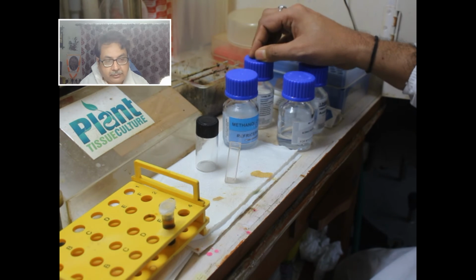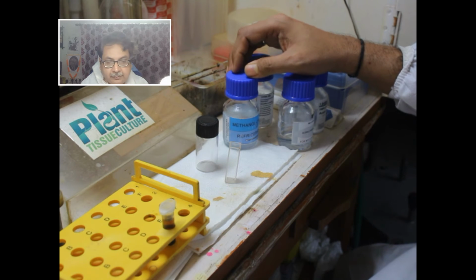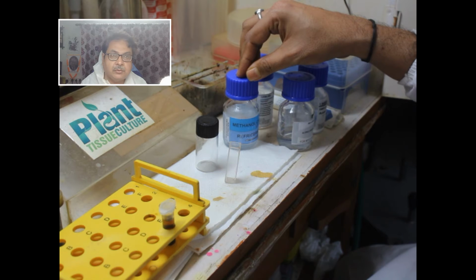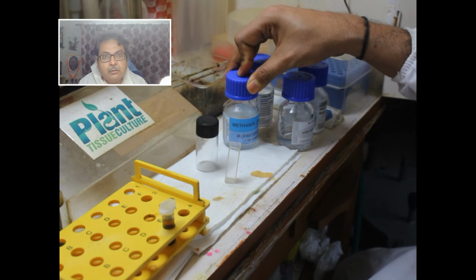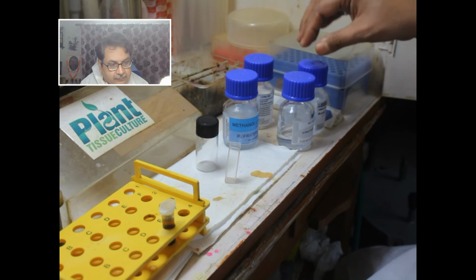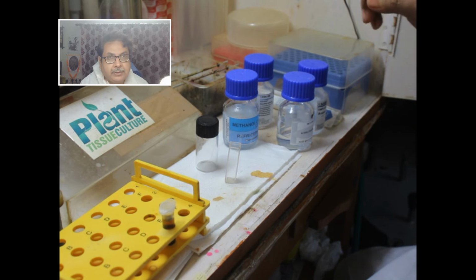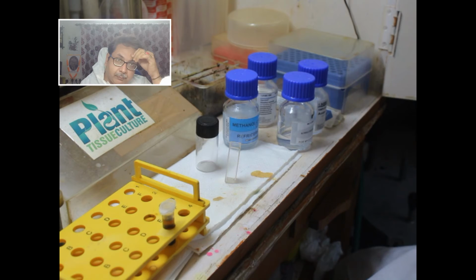this dimethyl sulfoxide. The methanol and chloroform mixture only gives response to the Moniliformin, so this is not mainly used. Actually we use this DMSO, this is universal, and this acetone alcoholic potassium bromide. But today we will be using this DMSO. So the process is the same.